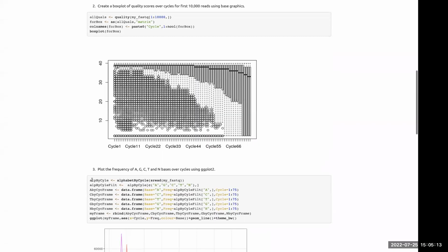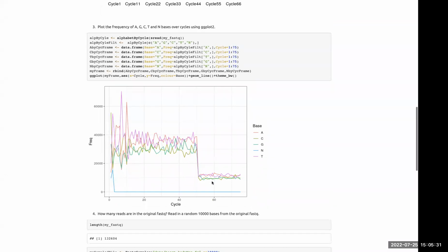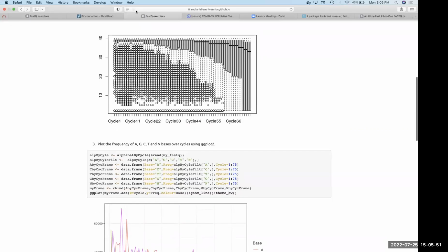But importantly, this type of plot where we can see read quality dropping across time, time being cycles here because we start by sequencing the first base and we get to the last base, is often to do with reagents running out. And then we may see some bias across time. You actually don't see anything here, but you may see bias across time also inside the base pair content. But more often you will see some bias often at the beginning or some bias at the end. Okay, so just keep an eye out for this, things which look different from your average FASTQ you're processing.